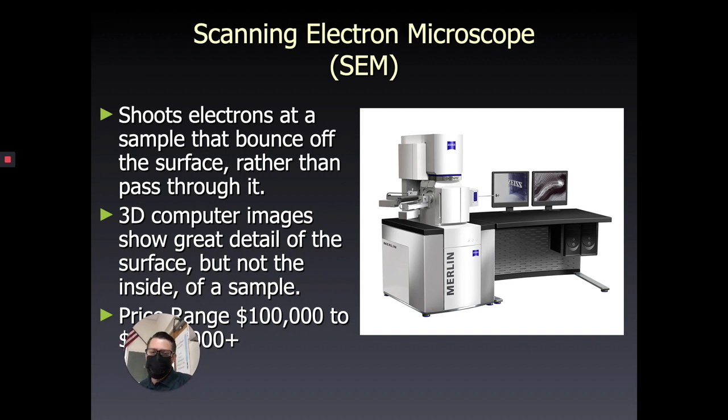I've had people look at this image here and say, oh, could my head fit inside of that imaging chamber? Maybe, but only if you're willing to cut your head off your shoulders, because in order to image something, you have to be able to shut that door, and then it is vacuum sealed. Okay? Because we can't have air molecules floating around as we're shooting these electrons, because those air molecules could actually ricochet those electrons, which would cause a blurry image. So we got to basically close the door and suck out all the air to get a clear image. So as a result, if we were to put something alive in there, it's not going to be alive for very long. Okay? It's going to basically suffocate.